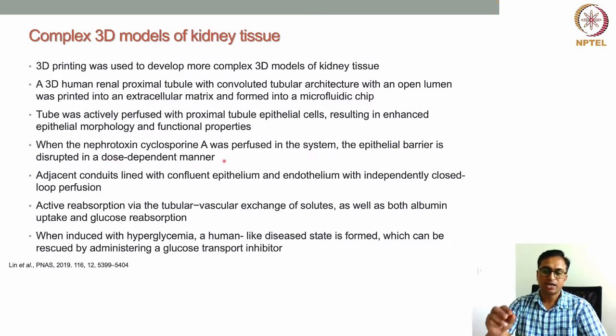So that means at very low dose, that epithelial barrier is probably not disrupted completely, but when the dose was increased, that epithelial barrier was disrupted, and that kind of disrupted epithelial barrier cannot do the physiological function. So this is actually a physiological response that was seen in a 3D printed model. So that's a very important outcome from the study.